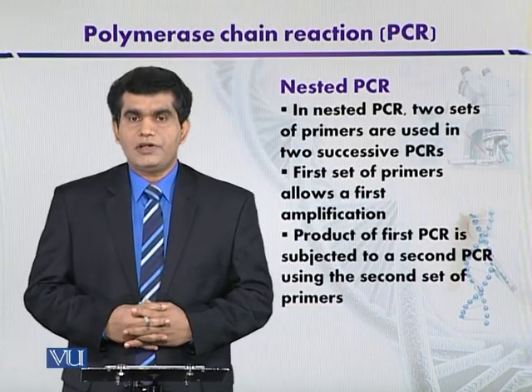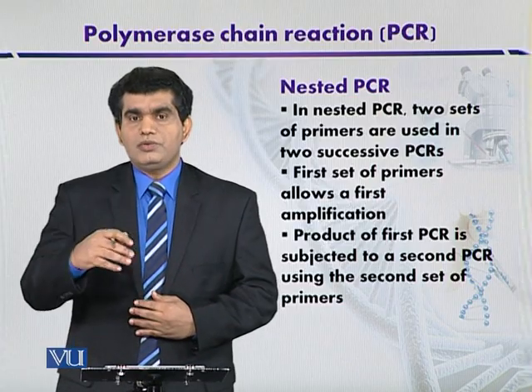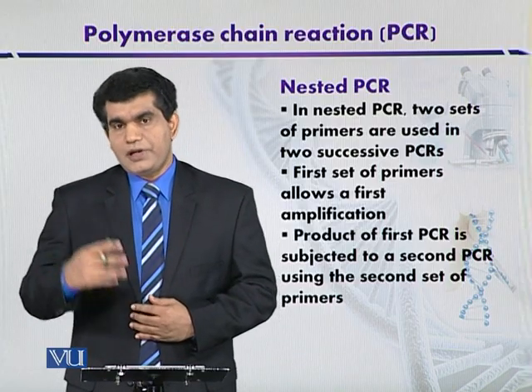Nested PCR. In nested PCR, two successive steps are used by using two sets of primers.